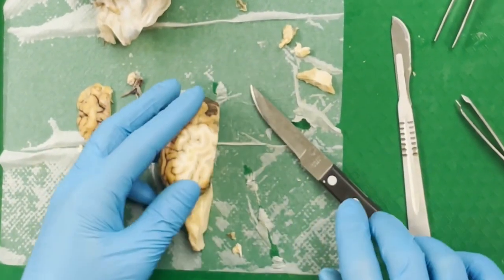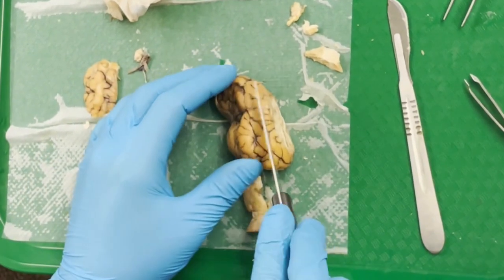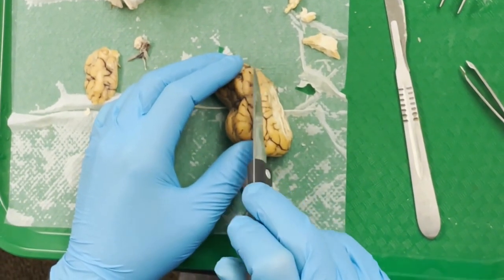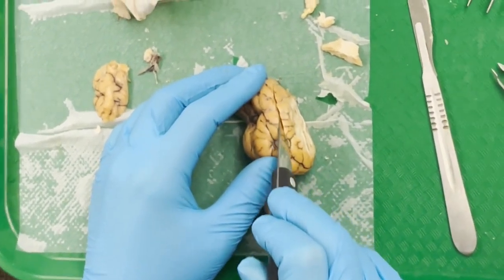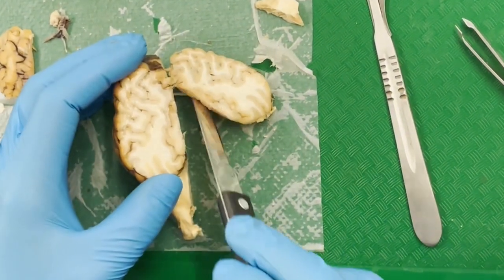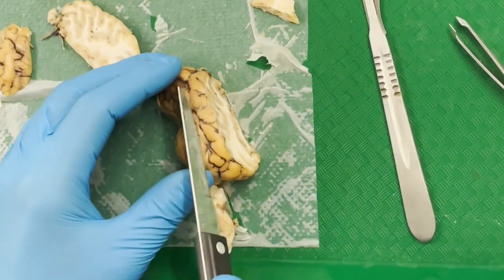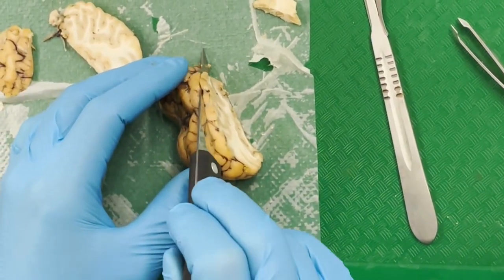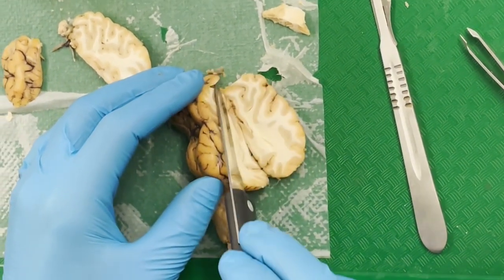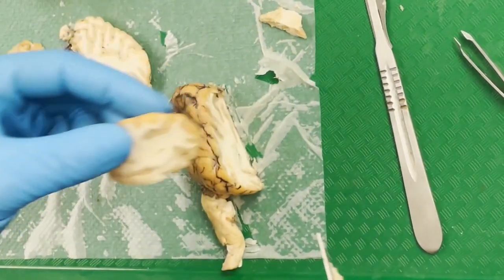We take a look at the dorsal view again, making sure I'm not cutting too much. Then we continue, take off like another few millimeters. In this case, I might saw a bit, but that's not the worst thing in the world. Okay, so not exposed yet, just another slice. I'm gonna saw off another millimeter or two. Okay, I've started to expose the top.